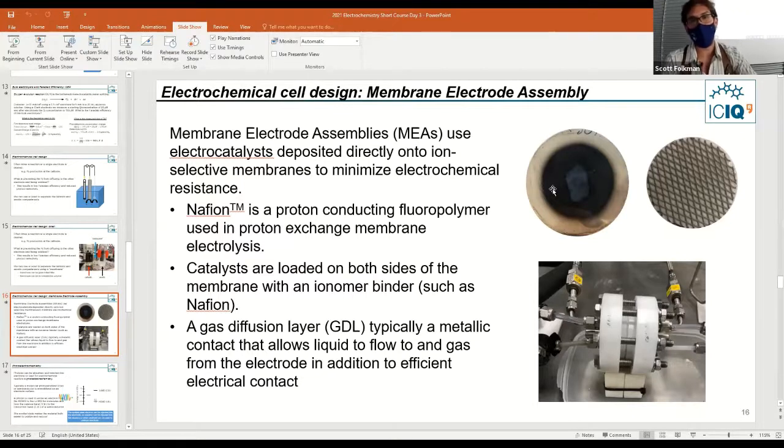And another audience member brought up a very good point that oftentimes researchers, when they're doing synthesis, will use constant current. Now, constant current has the advantage of you will continuously apply a certain amount of current for a certain amount of time. So if you know you have 10 coulombs of product, you can apply 10 milliamps for however much time, and you know you should have theoretically reduced or oxidized all of your reactant. The problem with that can be that you're not controlling the voltage.